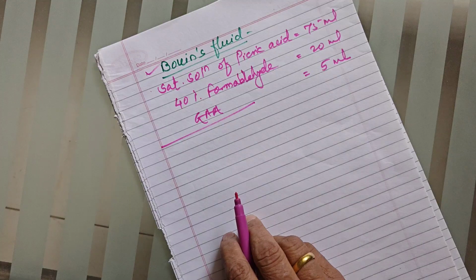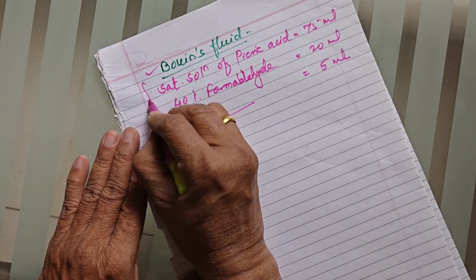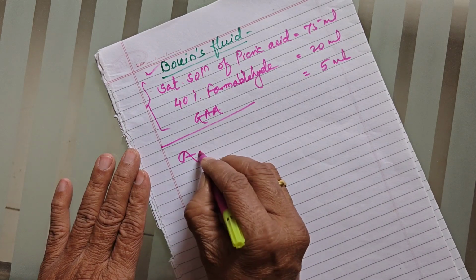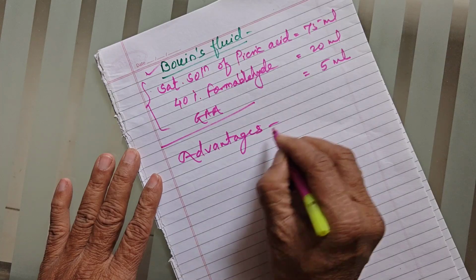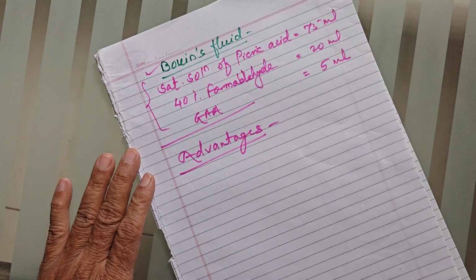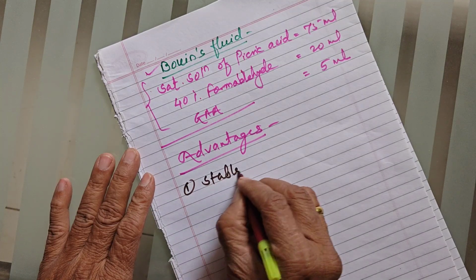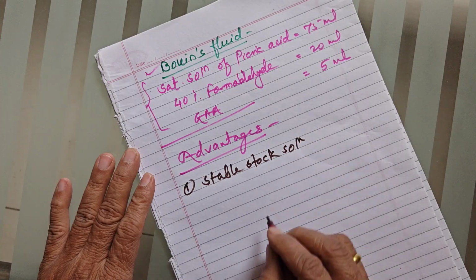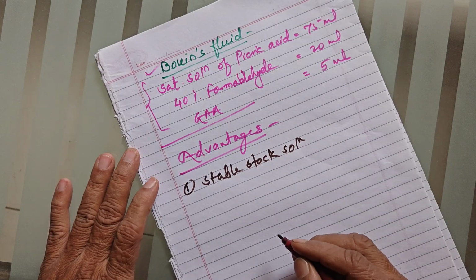The advantages of Bouin's fluid: it can be made as a stable stock solution and is ready for use at any time.